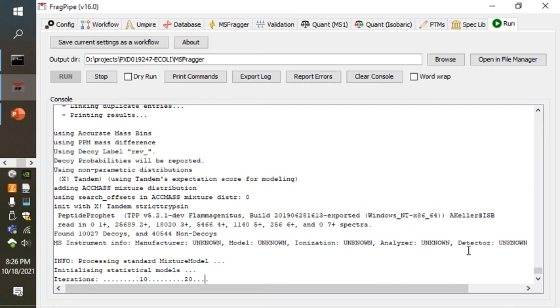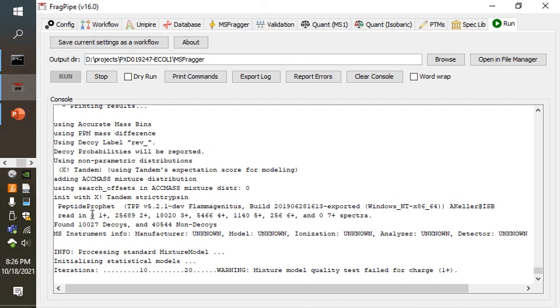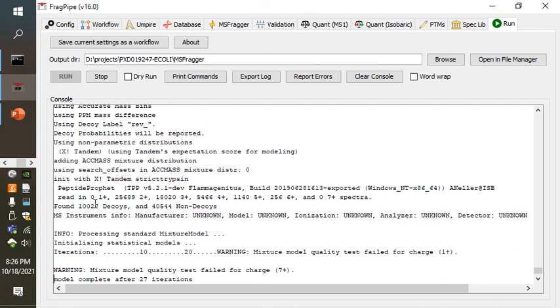So what is the ideal distribution of PSMs and precursor charge? I would note that today, most people running Orbitrap class instruments tell their instruments not to collect tandem mass spectra for singly charged precursors.